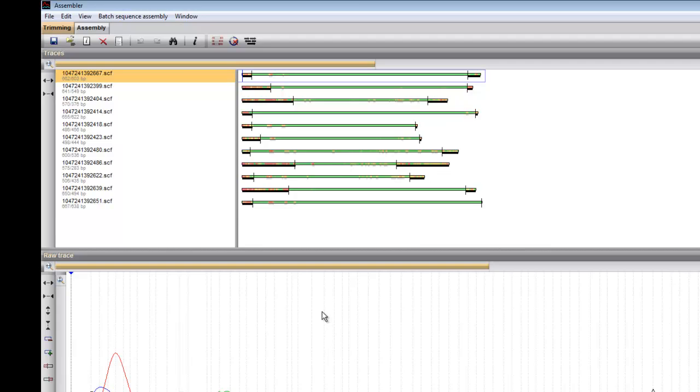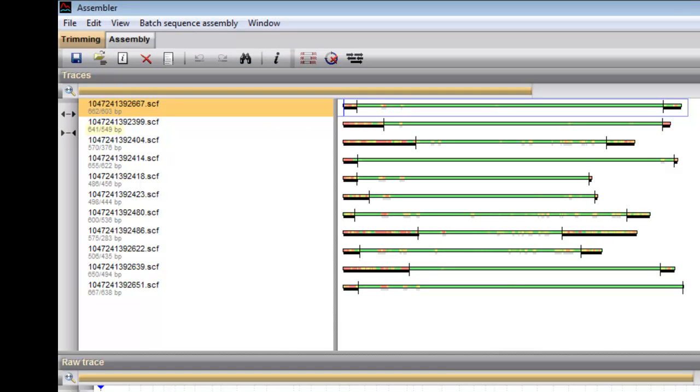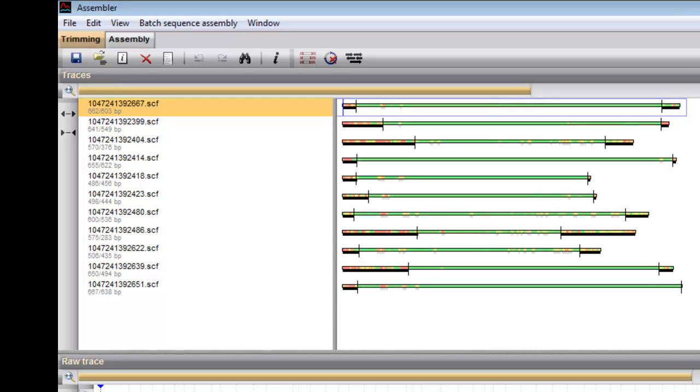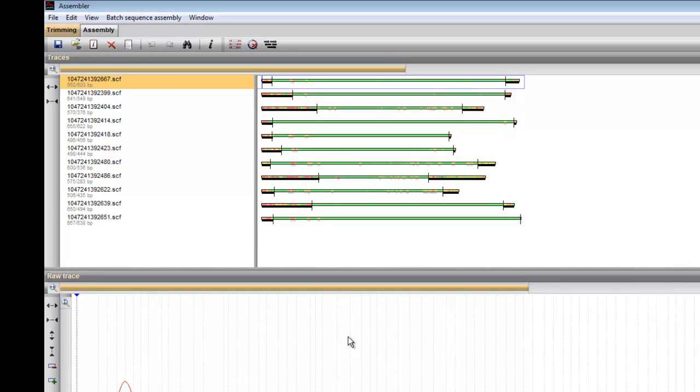The left upper panel lists the names of the chromatogram files, each with their length in base pairs before and after trimming. The upper right panel gives a graphical overview of each partial sequence, showing a color code for the quality of the densitometric curve.